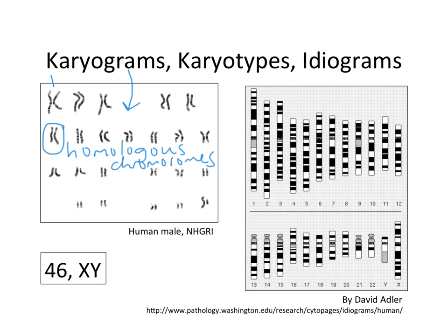There are two copies of chromosome 1, two copies of chromosome 2, and so forth, until we get down to the smallest chromosomes, 21, 22, and the X and the Y chromosomes, the 23rd pair. Thus, this is a male karyogram.